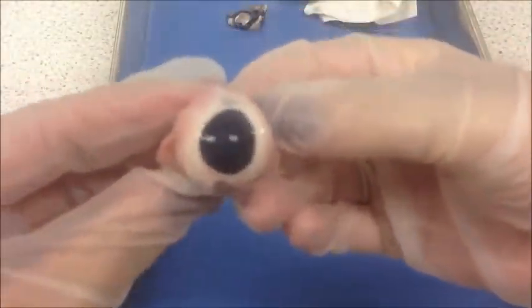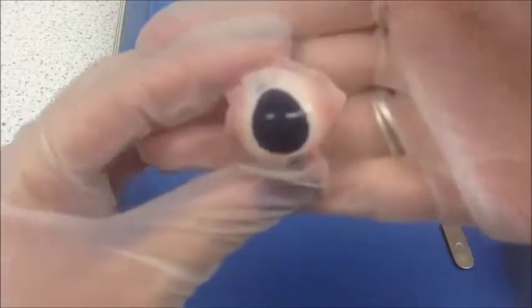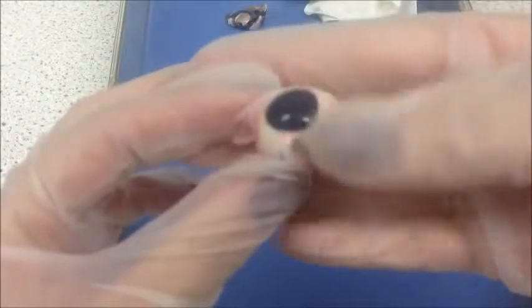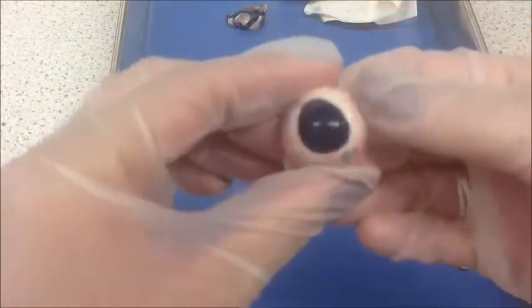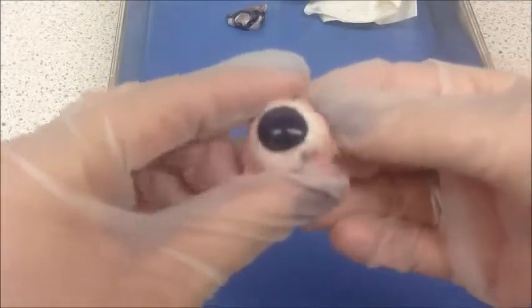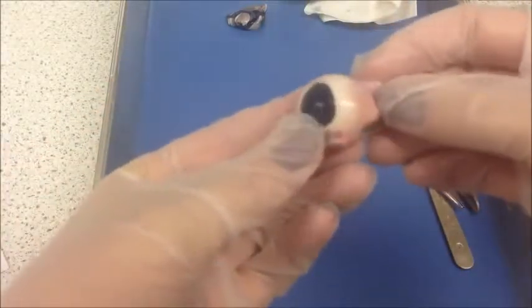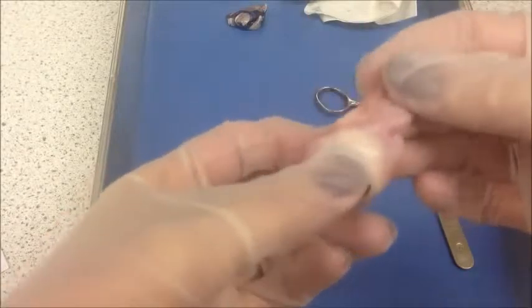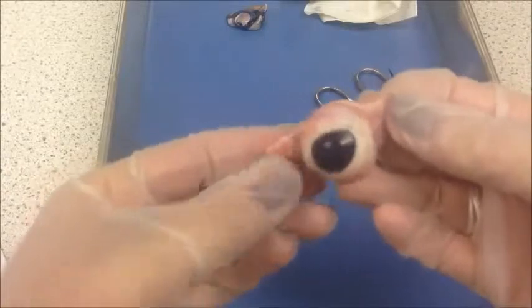So let's get started. Here is my pig's eye. One of the first things you'll notice is the extra fat and tissue surrounding the eyeball. In a human, there are 6 muscles attached to the eyeball to enable it to move up, down, left and right. The fatty tissue cushions the eye from the surrounding bone in the eye socket. Usually you would trim this extra tissue off, but there doesn't appear to be a lot on this eye, so I'm just going to leave it.